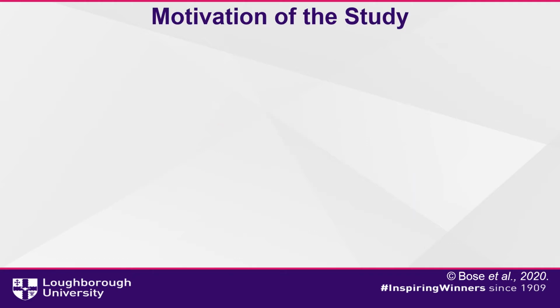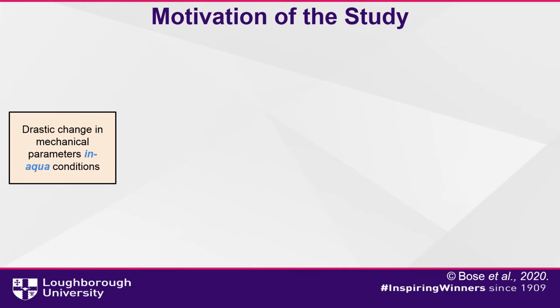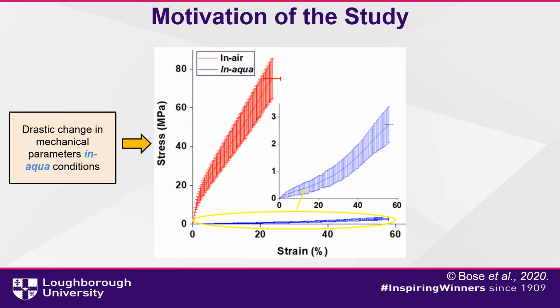Motivation of the study. It was observed during uniaxial tensile test that collagen films tested in aqueous conditions showed a drastic difference in mechanical properties as compared to those in air conditions. The figure shows the radical change in the stress-strain curves of in-air and in-aqueous conditions.